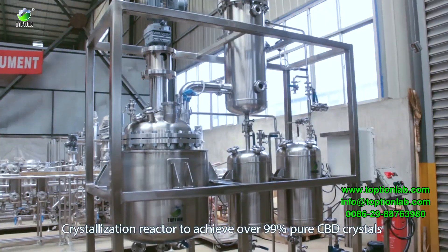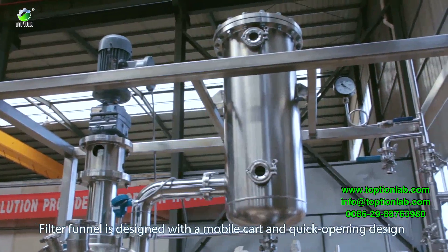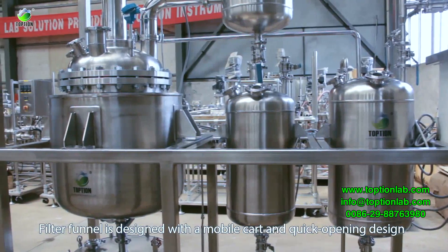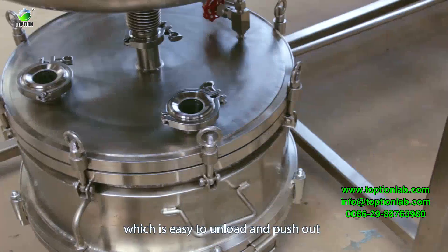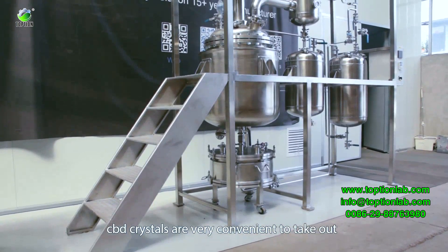A crystallization reactor achieves over 99% pure CBD crystals. The filter funnel is designed with a mobile cart and quick-opening design, making it easy to unload and push out so that CBD crystals can be conveniently taken out.